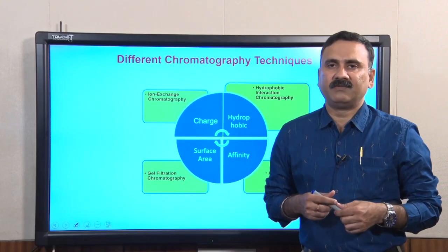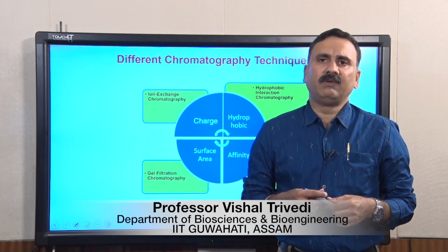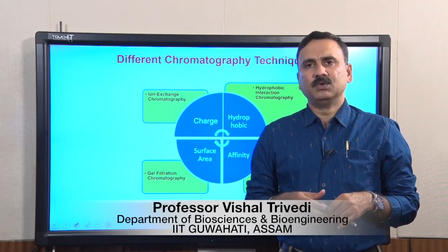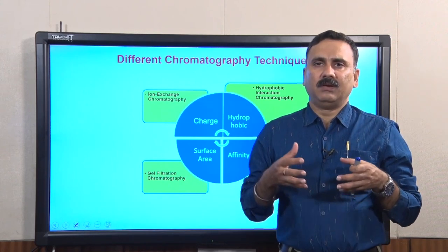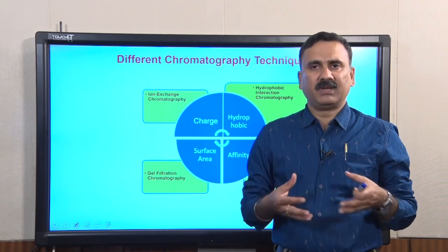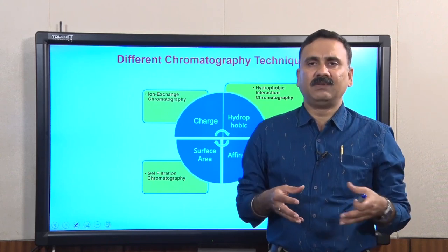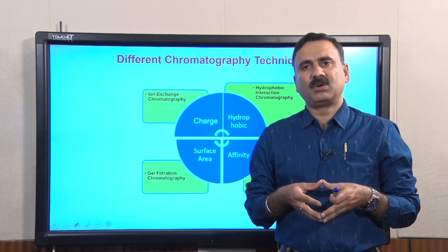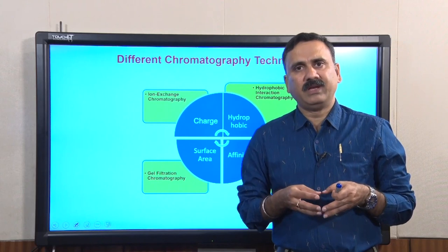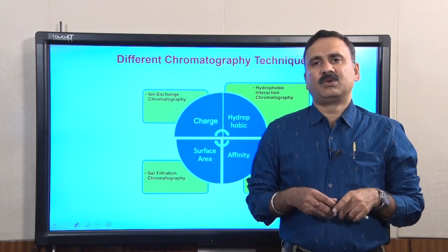Hello everybody, this is Dr. Vishal Trivedi from the Department of Bioscience and Bioengineering, IIT Guwahati, and what we were discussing about the different chromatography techniques which people are using to purify the protein or the other factors from the cells where they are overexpressing these components. In this context, so far what we have discussed about the ion exchange chromatography, hydrophobic interaction chromatography, gel filtration chromatography, and in our previous lecture we have also discussed about the affinity chromatography.